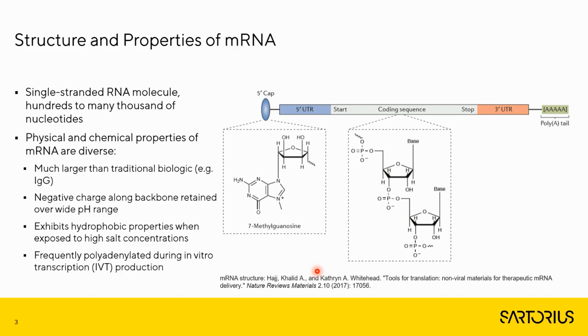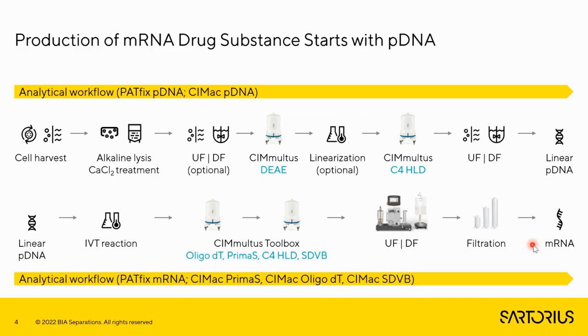And most of what we'll talk about today is captured, in fact, in this slide. If I start from the back, I would like to arrive at highly pure mRNA, and how we'll get there is we will describe the entire process of making mRNA from linear plasmid DNA, through IVT reaction, through purification. I will not dwell too much on TFF and filtration. This is covered elsewhere by my colleagues from Sartorius.